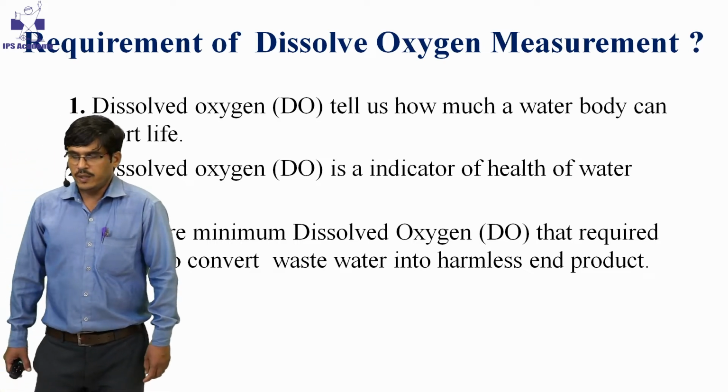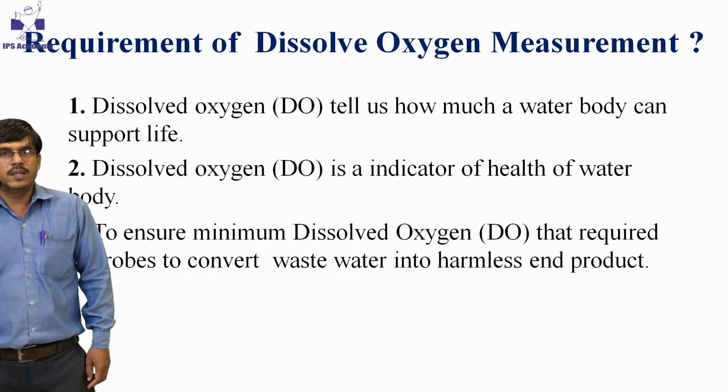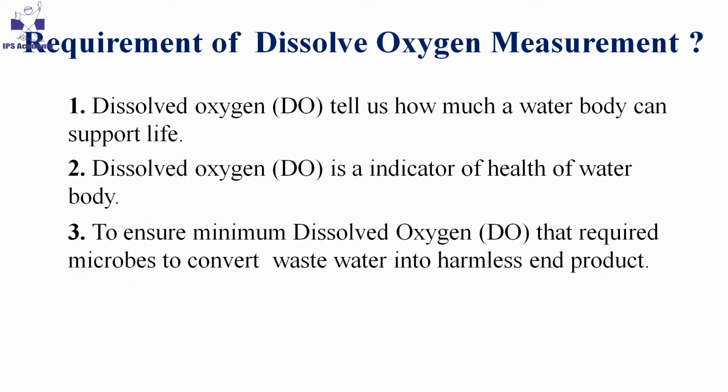Next, as we are going to determine the dissolved oxygen, why is dissolved oxygen measured? There are three or more reasons. That's why we determine the dissolved oxygen.